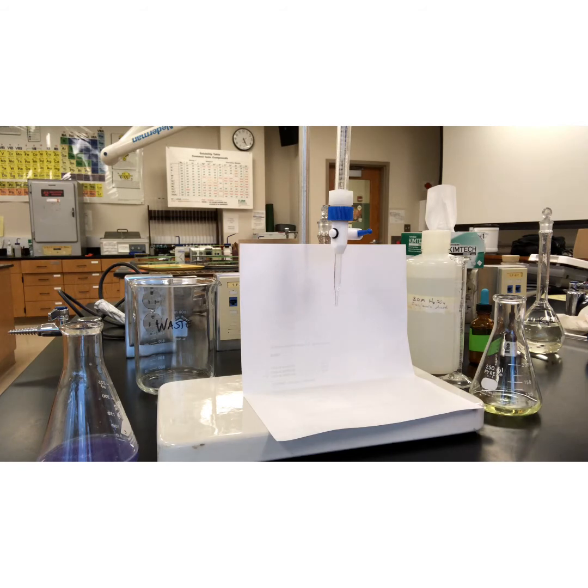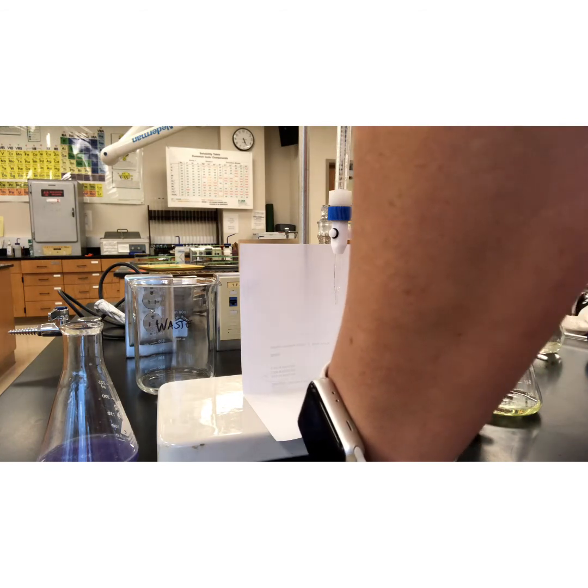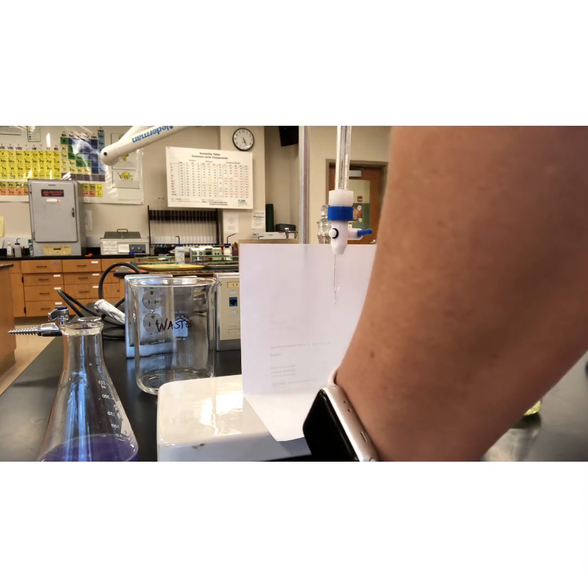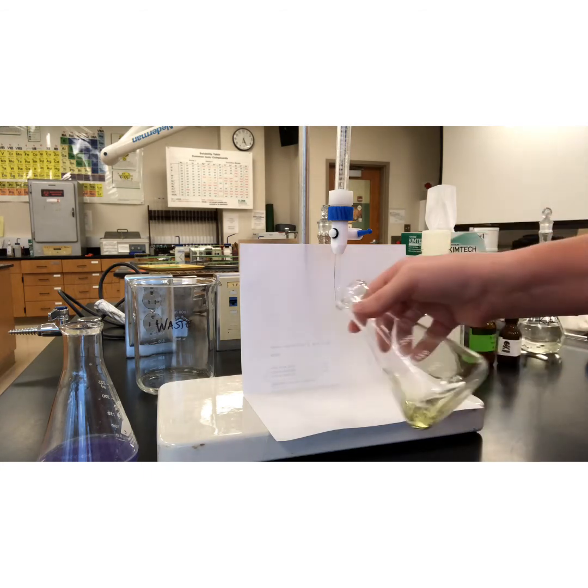So for test run number 2, the initial volume is 0.16 milliliters. So we're interested in the delta V for each one of these, our change in volume.